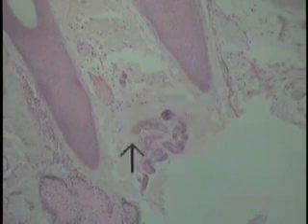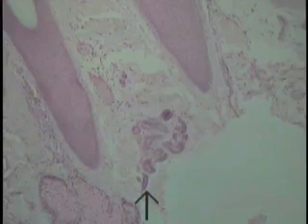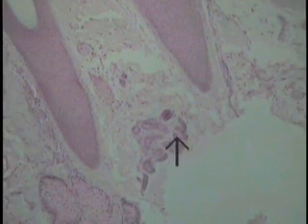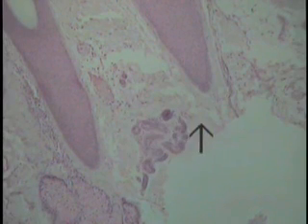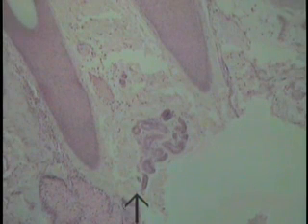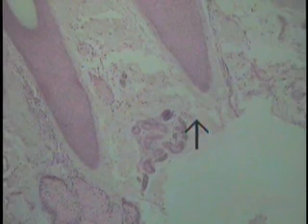One is illustrated here. This is a typical eccrine sweat gland. It's classified as a simple coiled tubular gland. It consists of a single tube that goes down and then coils upon itself, much like a snail shell. This is a section through one of those snail shells, which in actual fact is this simple coiled tubular gland.